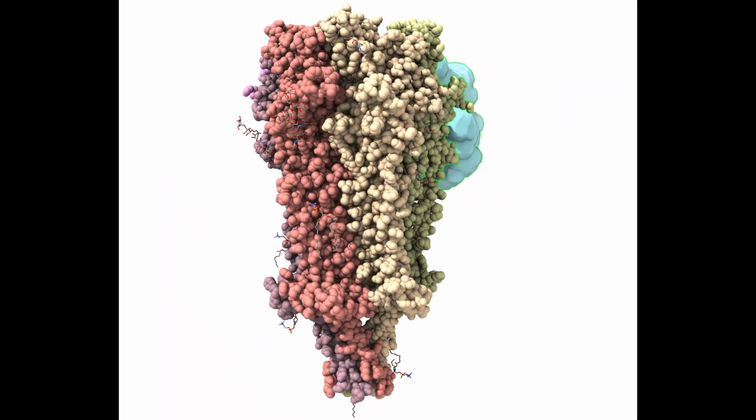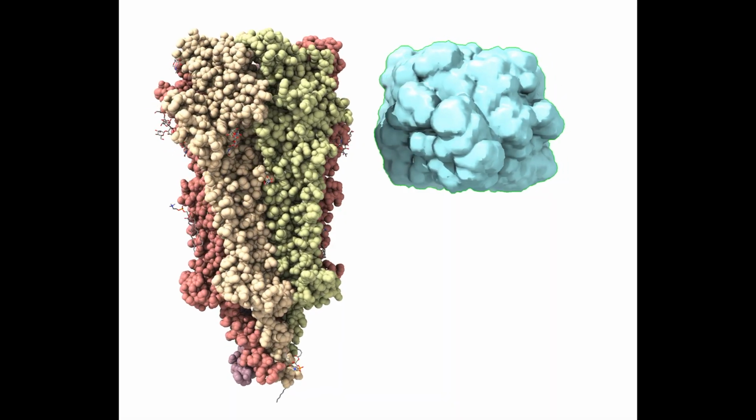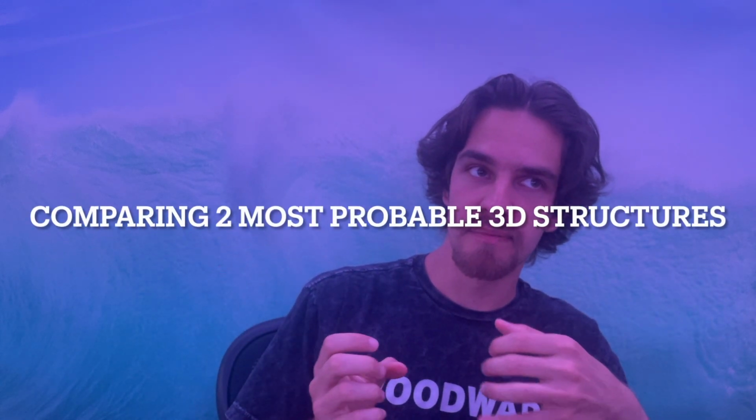And basically what we're telling this program is, instead of doing a 2D classification, where we're looking at a bunch of different 2D images that happen the most often, we're now doing a 3D classification with only 2 classes. So in theory, it's classifying these particles based on the way they look in 3D, but only in the region that we showed them, which is the blue mask that I made. And so from there, it can lead to a better 3D reconstruction, which I can show you now.